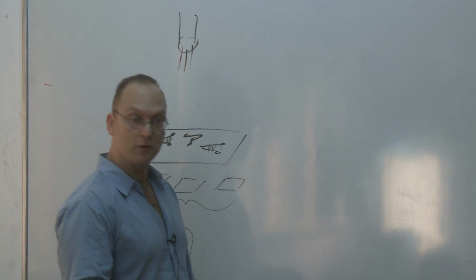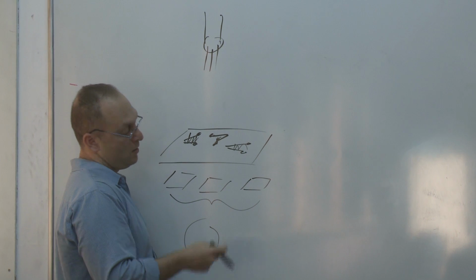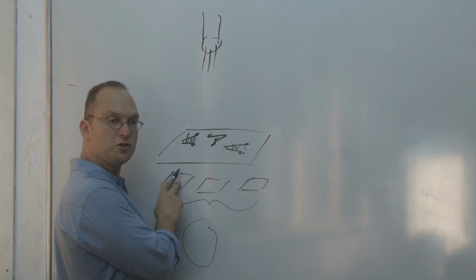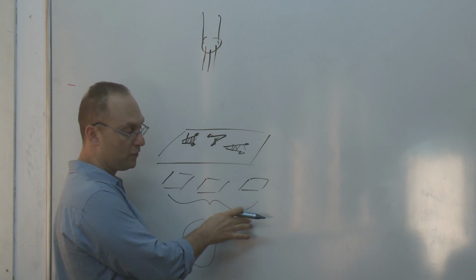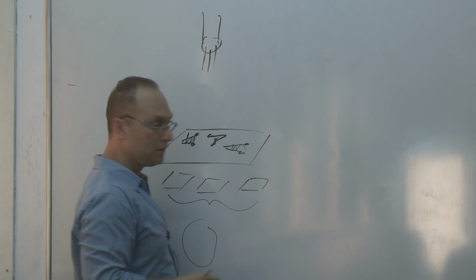Now there are two main difficulties involved. The first difficulty is that these images are very noisy, and this is a very severe difficulty. And the second difficulty is that you don't know the orientation which produced every image. So I'm going to focus on the second difficulty, but everything that I'm going to tell you about it is also relevant to the solution of the first difficulty of the noise. Okay? And I'm going to comment about it in the end.